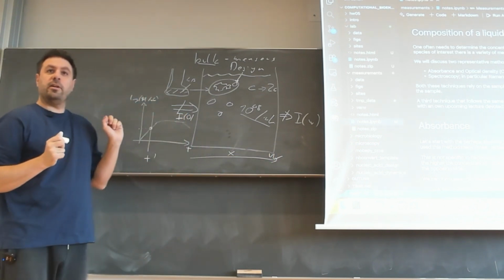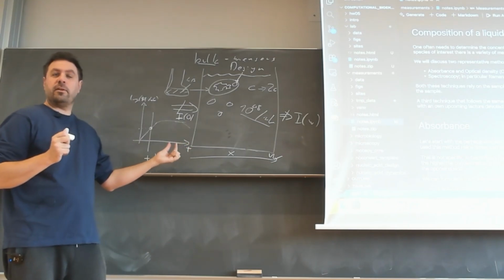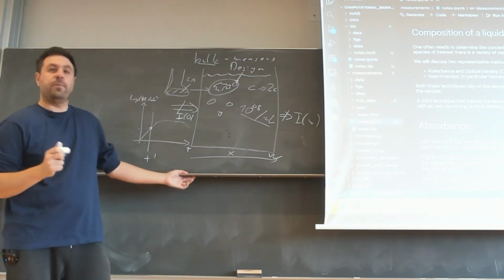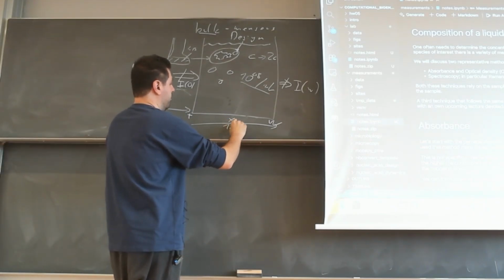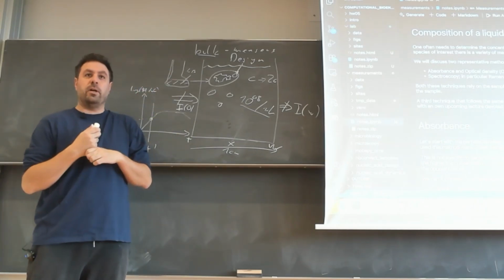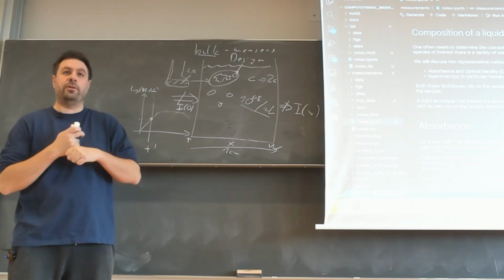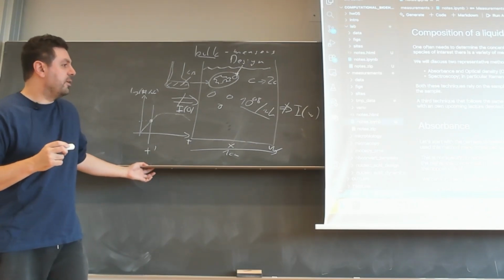It's very clear what happens if we have a very small slice, but it's not so clear in a larger space. How long is this W? Well, it will be in the order of 1 centimeter. It's a cuvette that you put in a device. There exist much smaller ones, but the typical one is in the order of 1 centimeter.